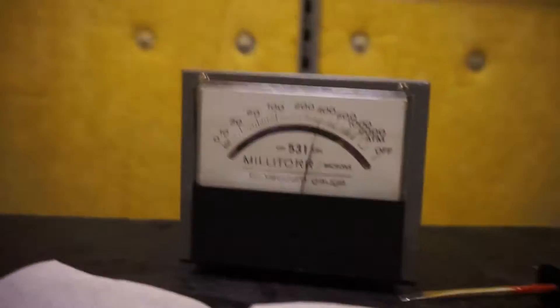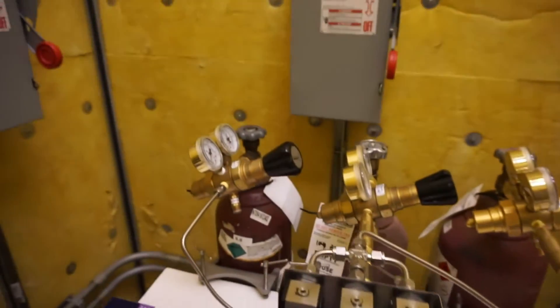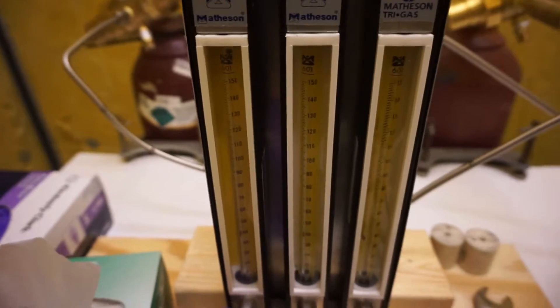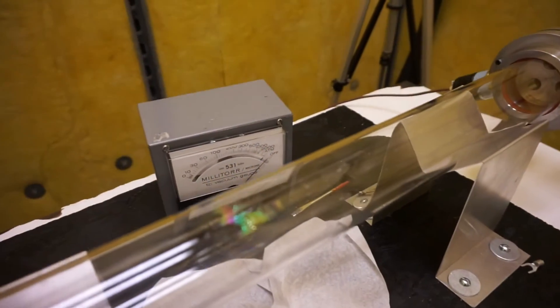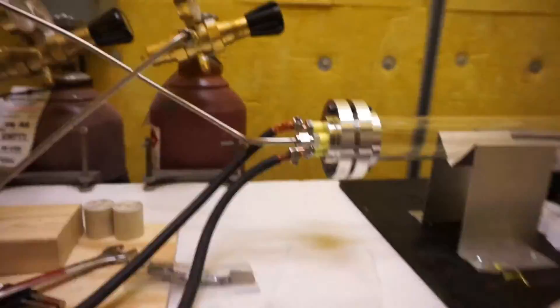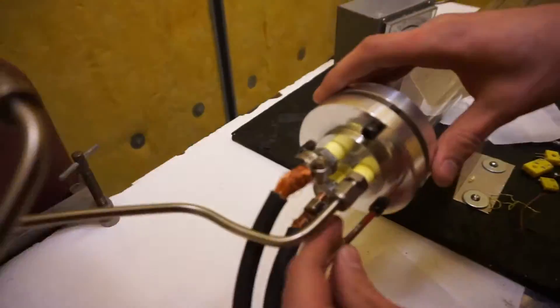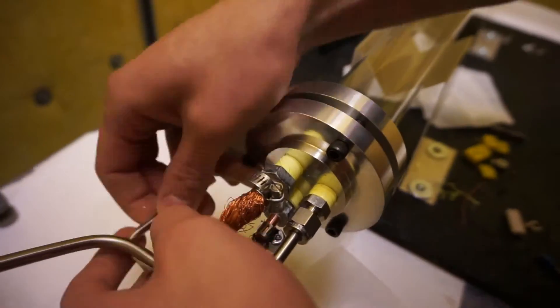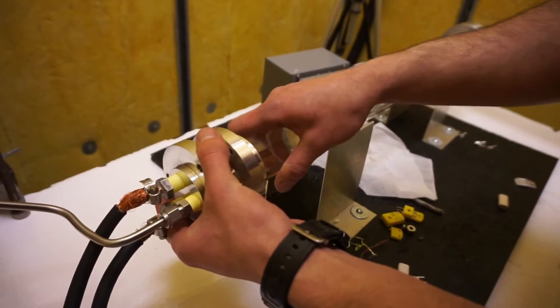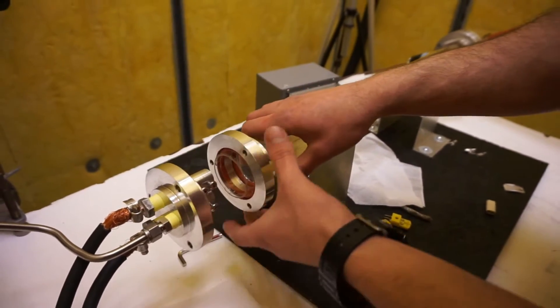We're reading 300 milliTorr. To come back to ambient we have a nitrogen tank, so I'm going to flow that now - you can see the ball indicator showing the flow. We're coming back up to atmosphere. We'll unbolt this and we're back at atmosphere.